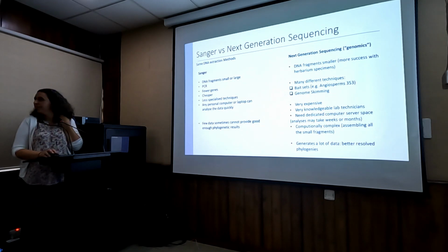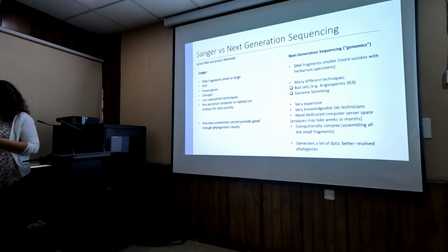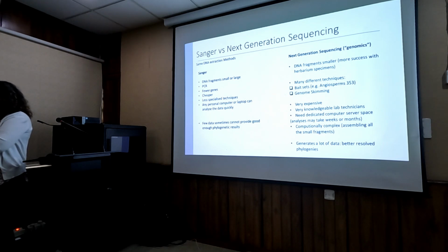Now I have a question. Actually, for herbarium specimens, which method is better, the Sanger or the next generation? Because in the Sanger case, the DNA is much more degraded from the herbarium specimen. So the standard markers in many cases are not working there. So for that, what type of protocol do we have to develop? What type of marker do we have to select with the degraded fragments? Or do we go for the Sanger one? Sorry, the next generation one.